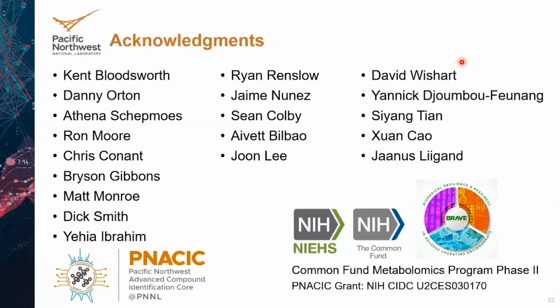Well, I think they'll still be used. I've had similar conversations with Oliver Fien and others that are also PIs under the NIH Common Fund Phase 2 program. Personally, I would put more weight on evidence that comes from multiple orthogonal properties than I would on one or two properties. And so I would assume that in that multi-dimensional, multi-chemical property space that we're using to characterize a molecule, you could get by with larger errors in one individual property using that aggregate of different chemical properties than what you could get by with if you were only using one property.